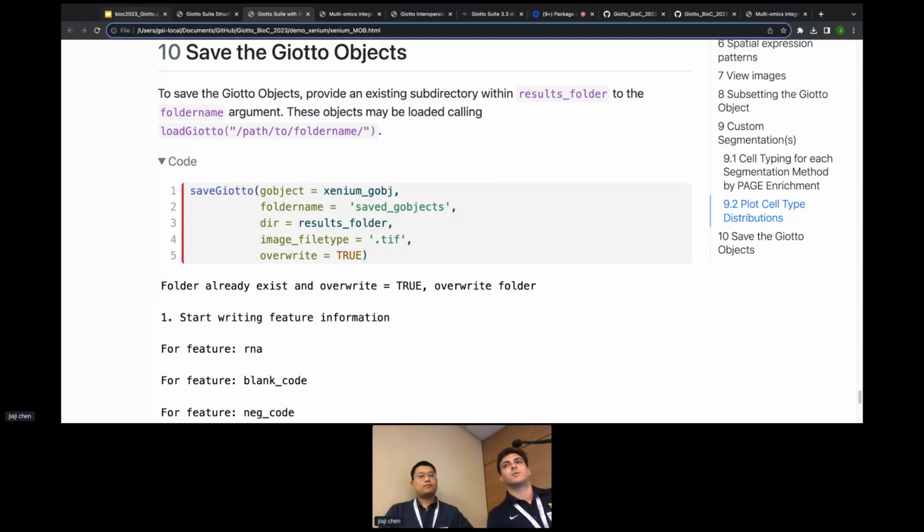And is there any reason why we wouldn't be building off of a single cell or spatial experiment and rebuilding these methods? Just right off the bat, you mentioned PCA. We do pipe in multiple Bioconductor methods, PCA being one of them, as an option for our users. But I think George can speak a little bit more to why we didn't build off of spatial experiment or single cell experiment.